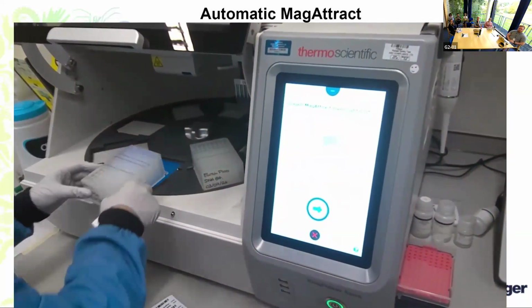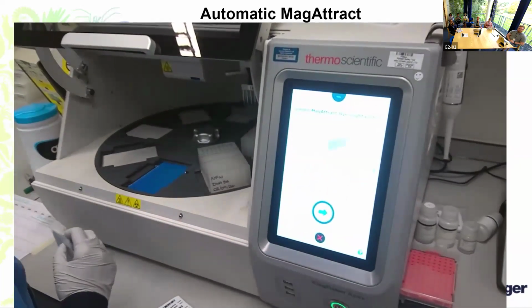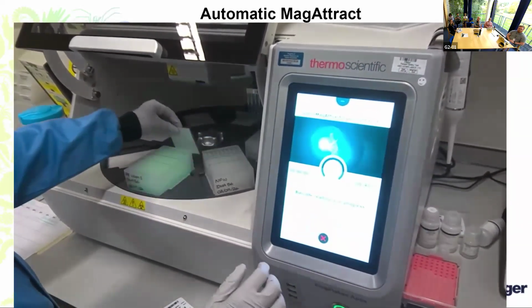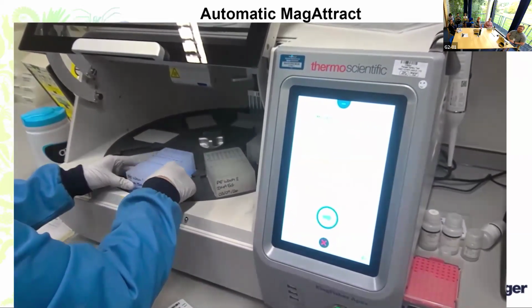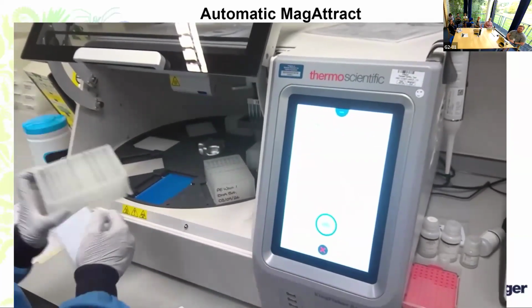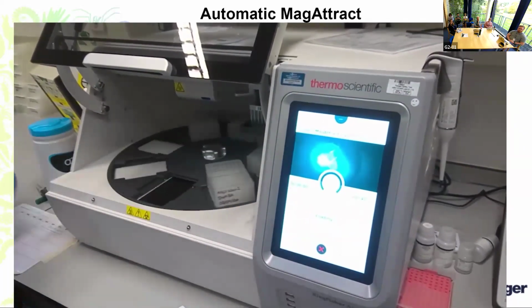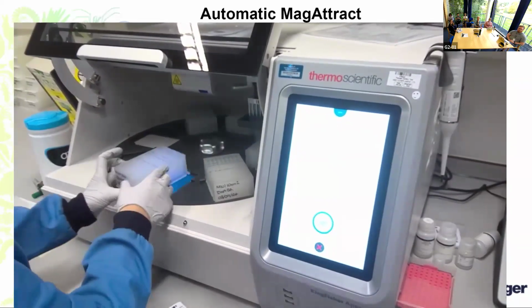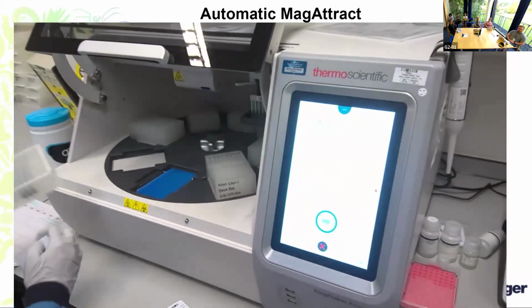So the Kingfisher works with deep well or short well plates that are placed onto a turntable and then scanned into the instrument. And then you can see on the top right of the instrument, there's the magnetic head, which transfers magnetic particles from plate to plate. So we can take our magnetic beads into the different wash buffers to remove contaminants, and then finally into our elution plate, where we can elute DNA in our elution buffer.